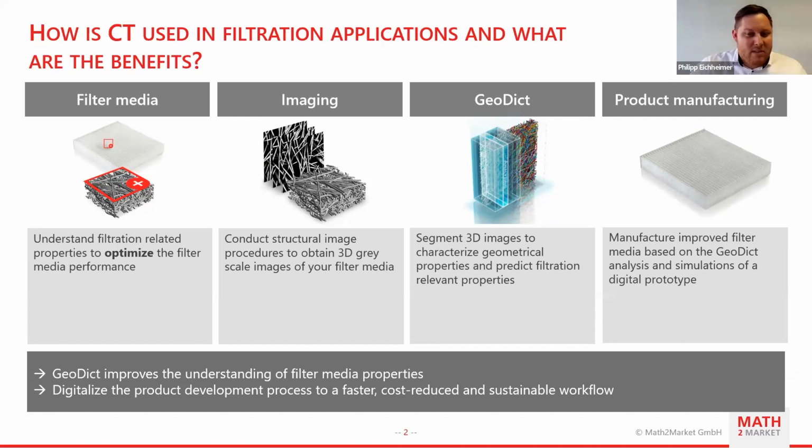And here the user labels the pore and solid phase by hand. And this serves then as the label input for the neural network. This is especially useful when you have segmentations of images where you have some fiber fractions or binder included, but here we'll give some more information later on in this presentation.